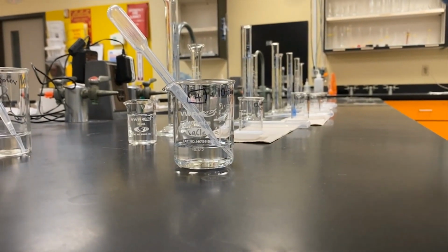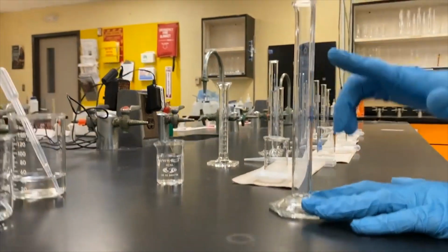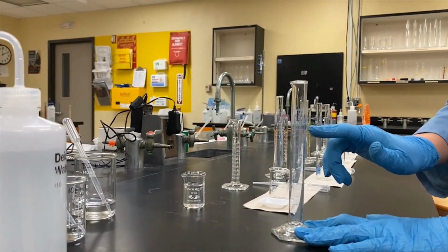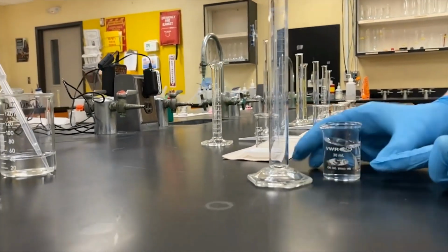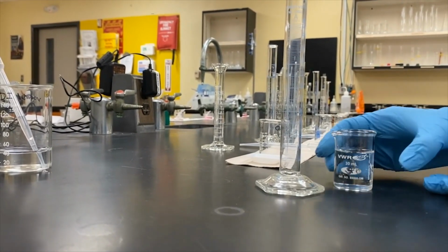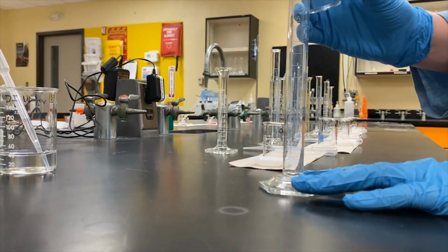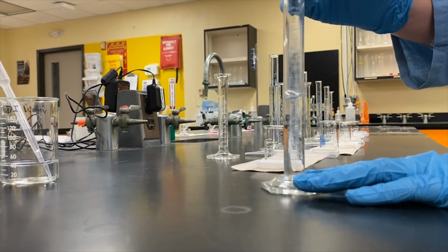And now I'm going to go ahead and pour my 24 milliliters. This is a 25 milliliter graduated cylinder, so I'm going to be wanting to shoot for right here. And to get the efficiency in a pour, I have used my non-analytical glassware to estimate about, and I really underestimated. I put a little bit under the 25 milliliter mark here, and I'm going to pour into my analytical glassware so I can know that I have exactly what I want.